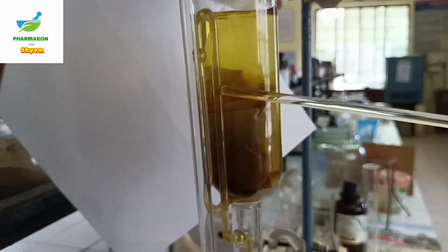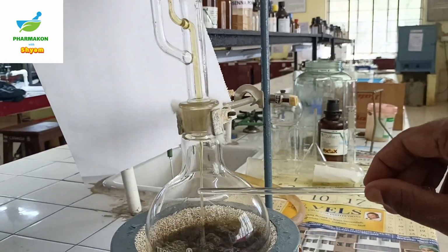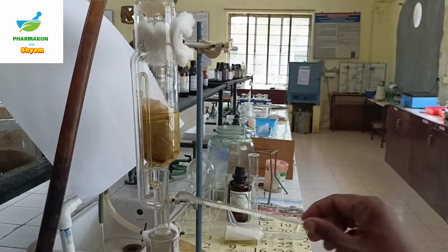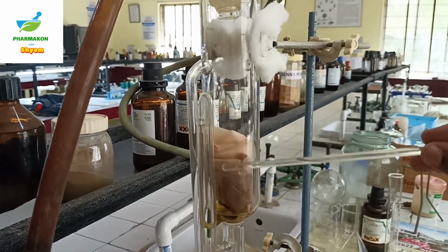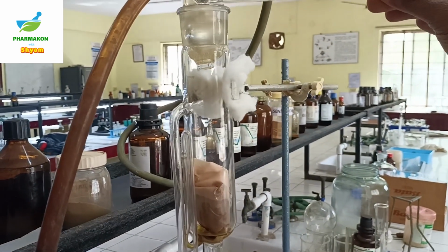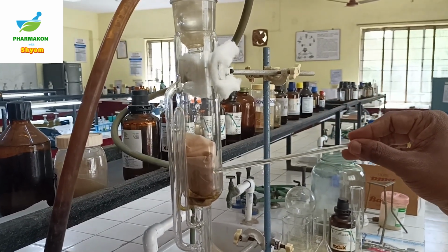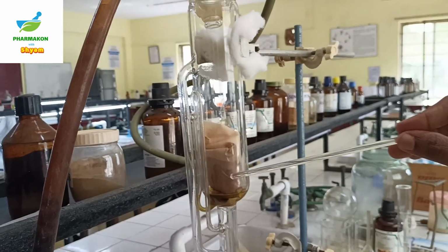Yes, you can see the solvent is draining back into the round bottom flask. So this extraction time is called one extraction unit. Now the solvent in the extraction tube is empty. Again it starts to fill through the condensation process. This process continues continuously, and you can see the extraction is taking place in a continuous manner. Hence the process name is hot continuous extraction process.